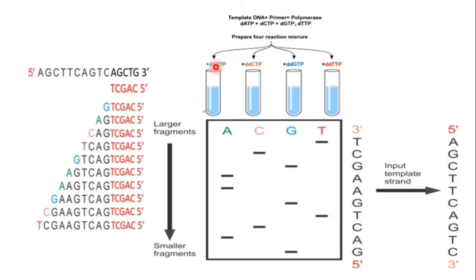After that, we keep these four tubes for the reaction, and it goes for amplification.